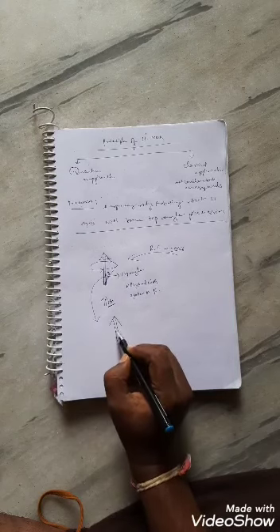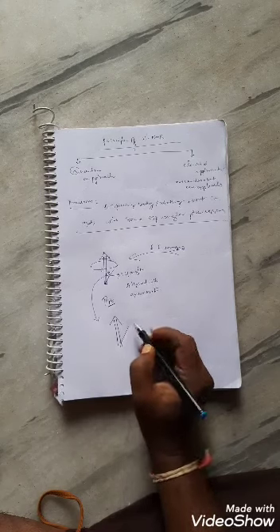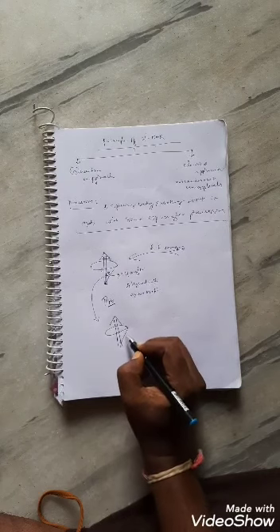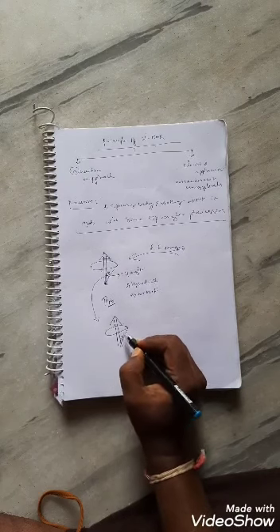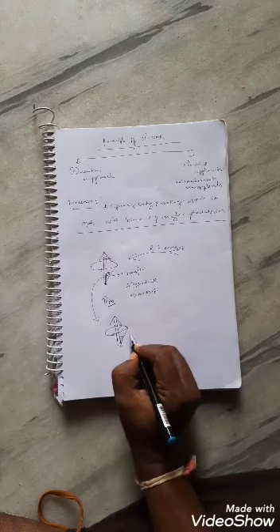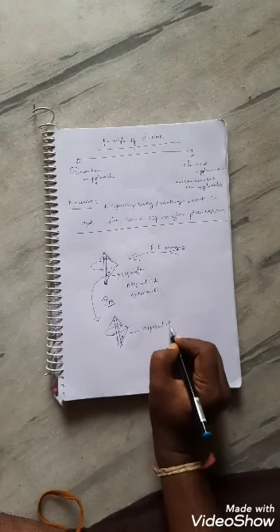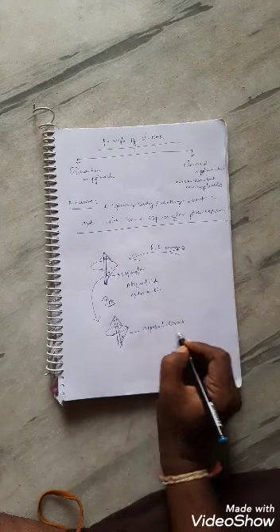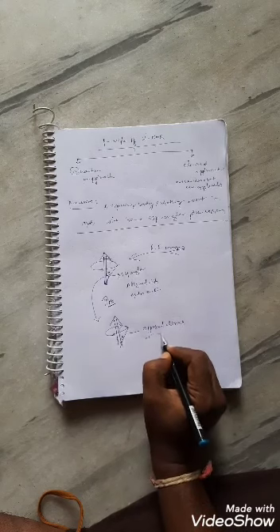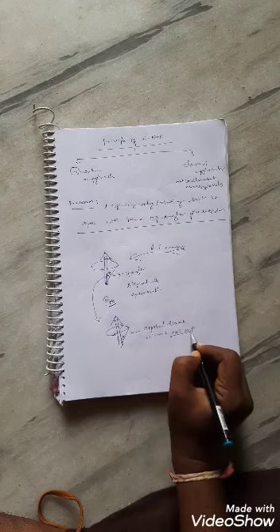And here the direction will change, and it is opposed in direction with respect to the external magnetic field, right?